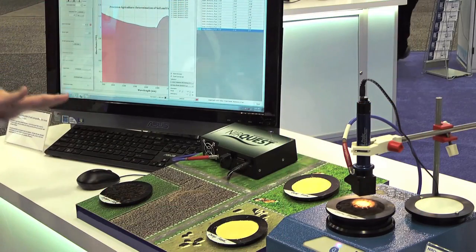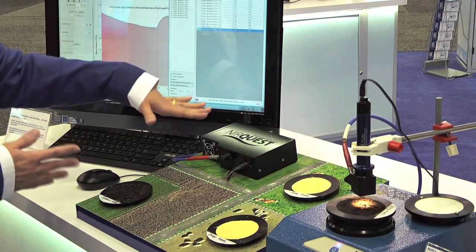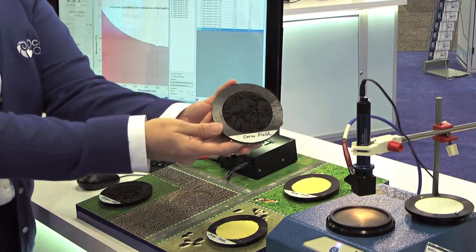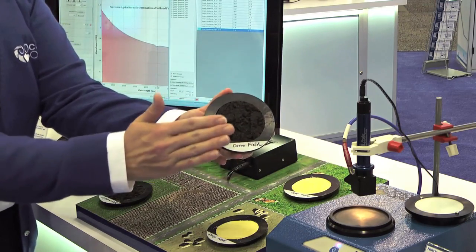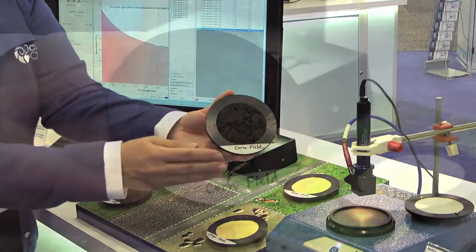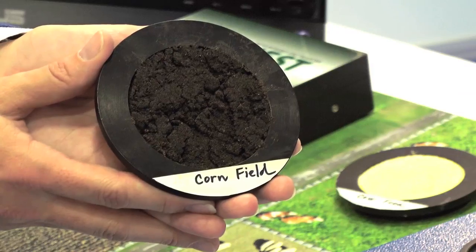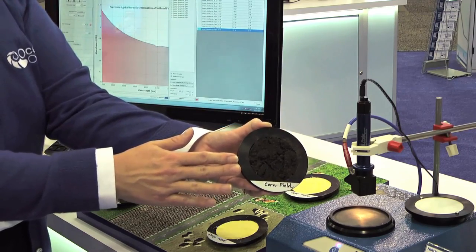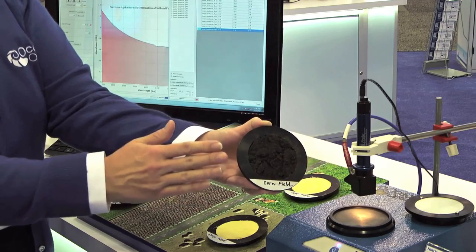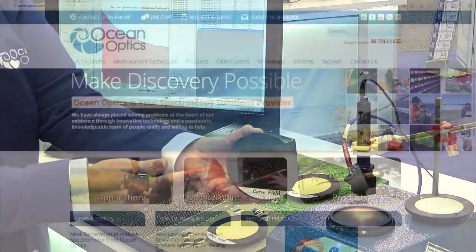Now it's important to note that these variations we're seeing when only looking at a single point are not related to the equipment itself or to the spectrometer or the measurements. They're actually related to the inhomogeneity of this sample — you can see there are differences in the height of the sample and differences throughout. These results, although accurate, are not as valuable and representative to help the farmer make sure that he's treating his soil appropriately to maximize his yield and minimize waste.